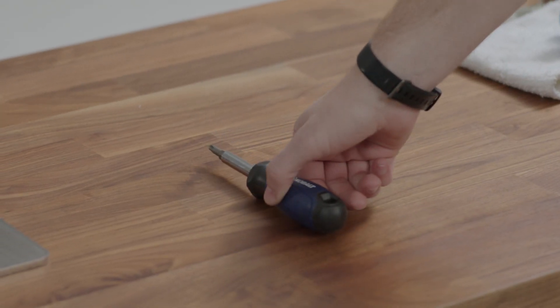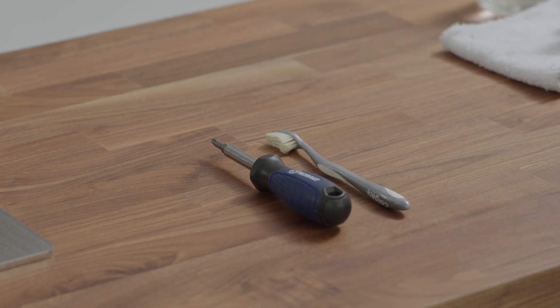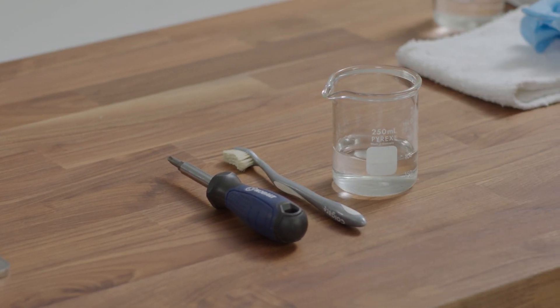For the cell maintenance, you'll need a Phillips head screwdriver, a soft bristle toothbrush, a container to place your beads in, as well as some either soapy water or a dilute hydrogen chloride solution to help clean the beads.